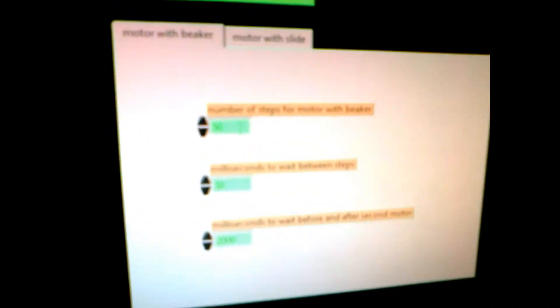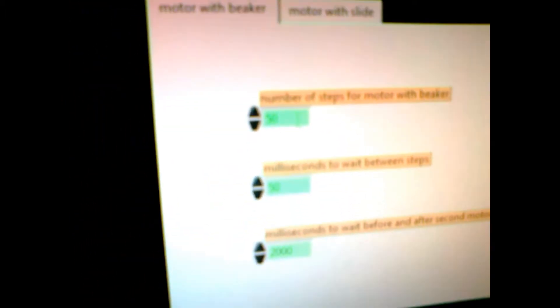Here, the first tab is for the stepper motor containing the beaker. We are putting 50 steps — the number of steps for the motor. After the completion of 50 steps, one beaker will be replaced by another. We are giving a 50 millisecond delay between each step. Before the robot arm starts moving towards the beaker there is a delay of 2 seconds, and after the dipping process is completed there is again a 2 second delay — so that time delay is set to 2,000 milliseconds.